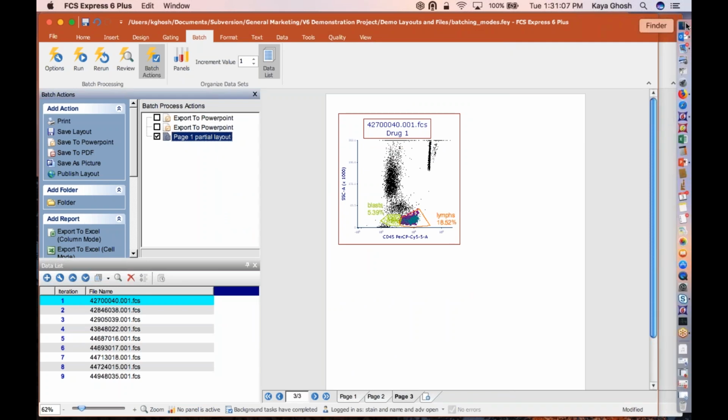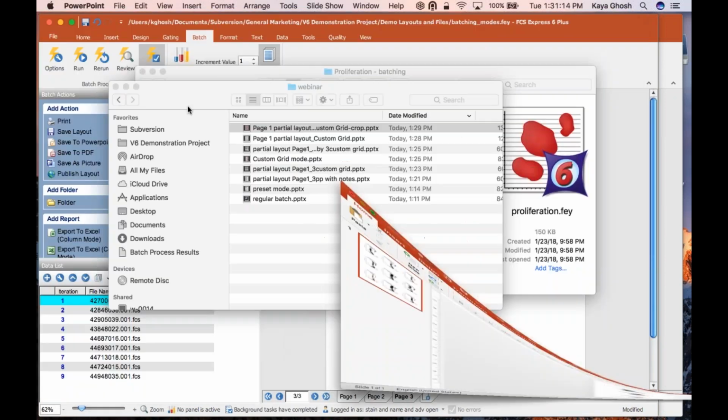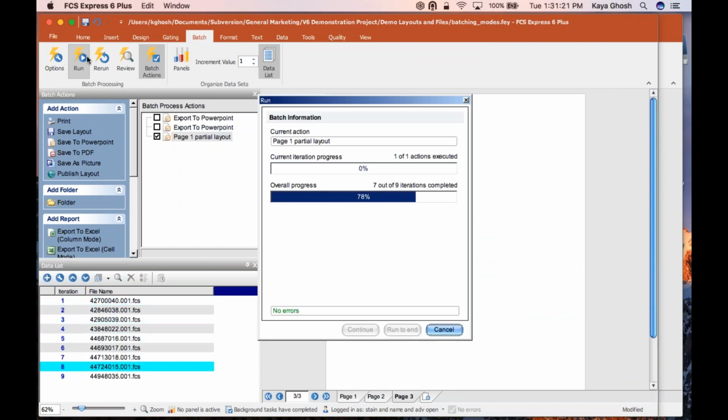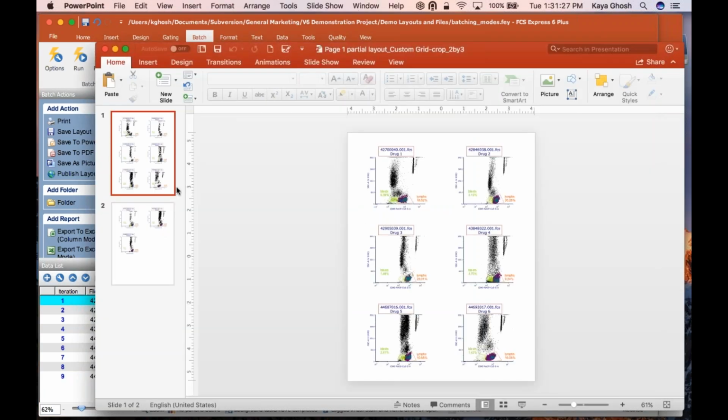And here's our last export that we've done together. Let's take a look at that. Oops, did that not go? Let's check again. Oh, there we go. Okay, so we have 1.5 slides. So here's the first slide and here's the second slide.